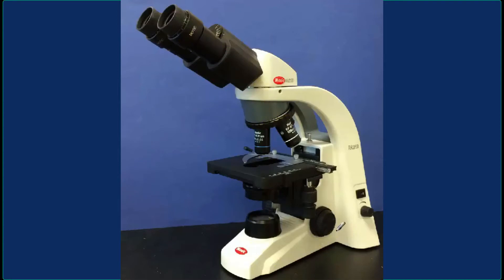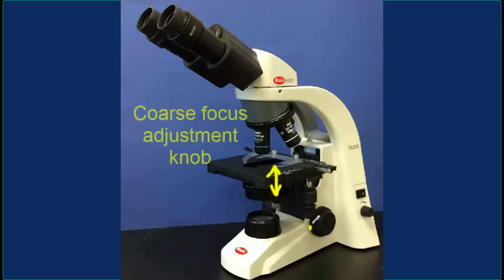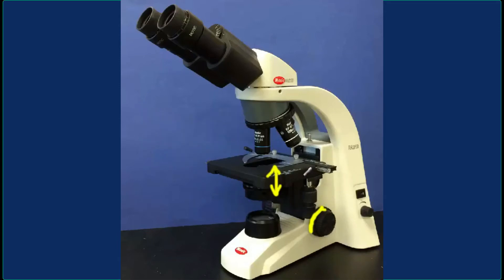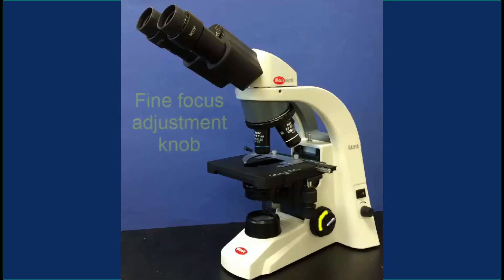Going back to the mechanical stage, right over here you have a couple of adjustment knobs that raise or lower the mechanical stage, which adjusts the focus. When you're trying to see something sharply, you have to move the specimen either closer or further away from the objective lens. The coarse focus adjustment knob, which is closer to the base, moves the stage faster so you achieve focus more quickly. The smaller knob further from the base gives more fine focus — this is called the fine focus adjustment knob.